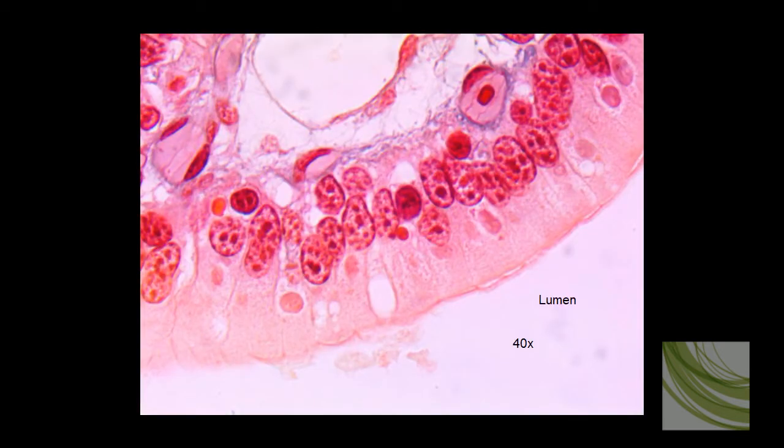Here is the same slide using the 40X objective. There's the lumen, this space. This is just part of a little villi. We can see nuclei in the cells, and we can see a goblet cell. This would be the basement membrane.